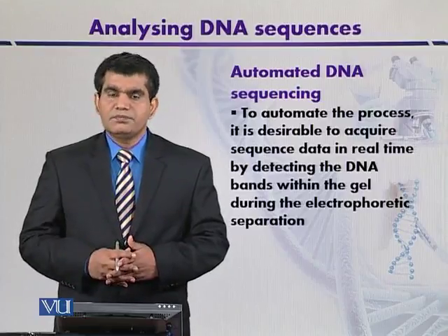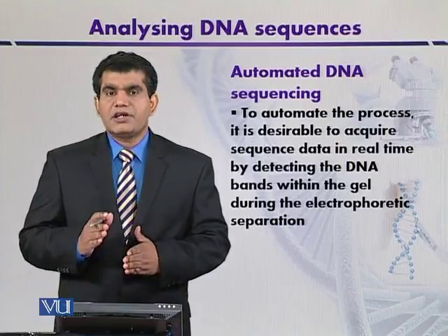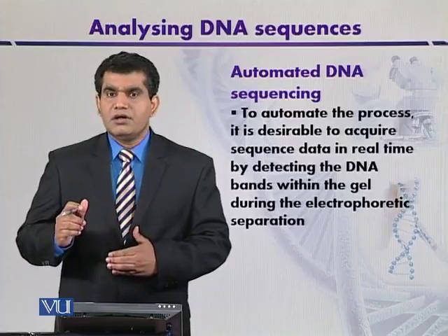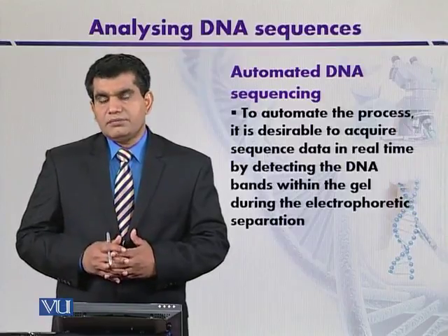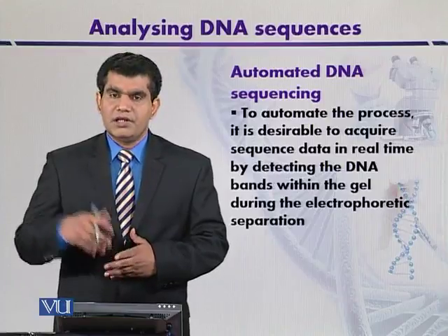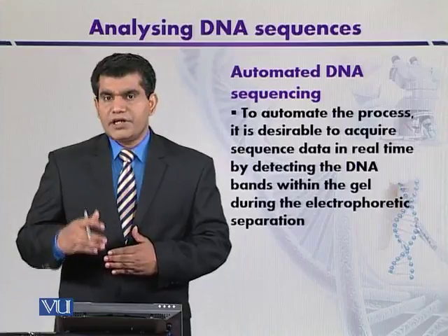And suppose in the Sanger method, the reactions are carried out separately in 4 different reaction mixtures, and after performing the reaction, the different fragments that are variable in length are detected by using a specific detector.